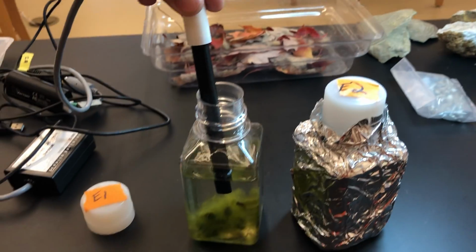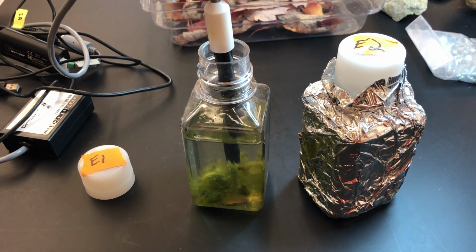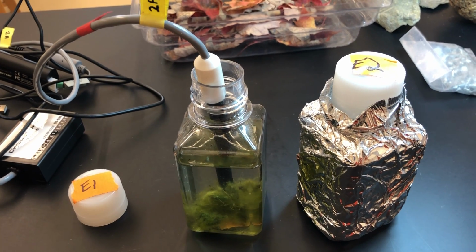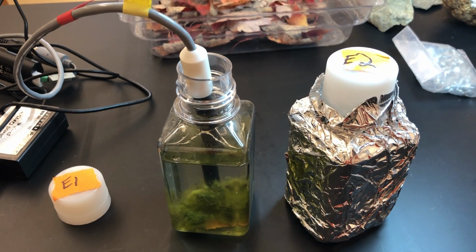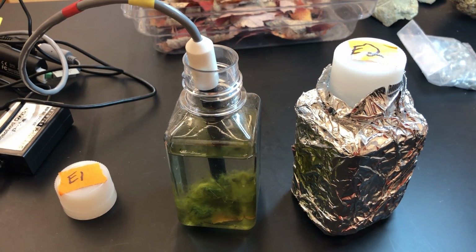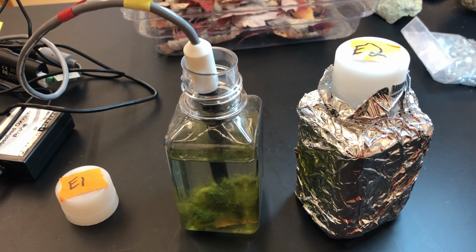So now I just very simply put this dissolved oxygen probe in with the algae and let it sit and settle down. There's a little bit of disruption and a little bit of oxygen introduced when I put the probe into the water, so I need to leave it for about 15 or 20 seconds to allow for that to settle so I can get a proper reading. And then I'm going to take a dissolved oxygen reading for each one of these, and then we'll look at the difference and see what we can figure out.